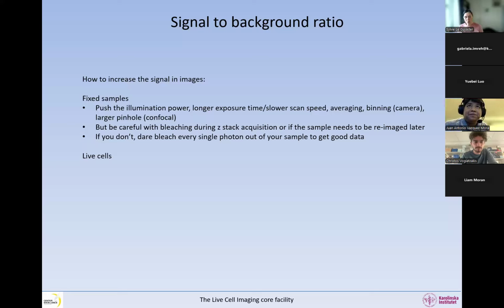At the same time, hopefully you have not made just one sample for your whole experiment, so hopefully maybe you have several of them. But you may have wanted to re-image only that exact same place, that exact same slide, to answer exactly the question. So yes, we have to think about the whole thing in there.